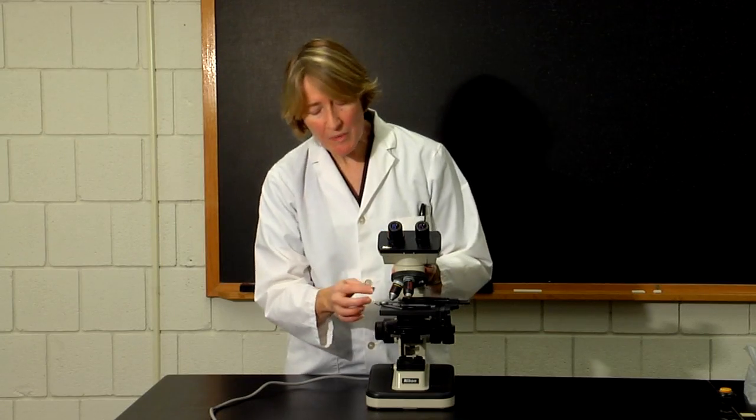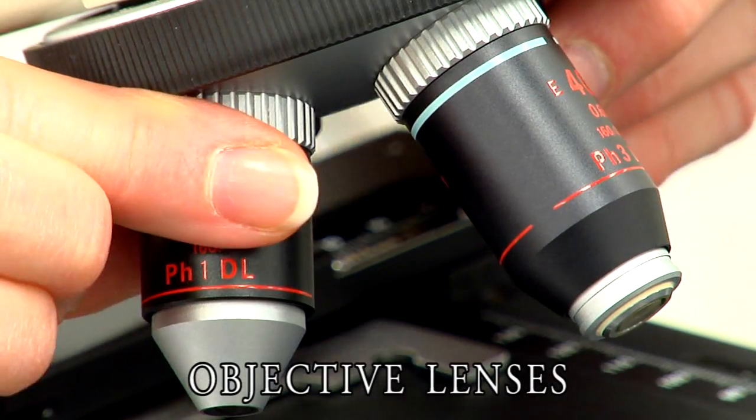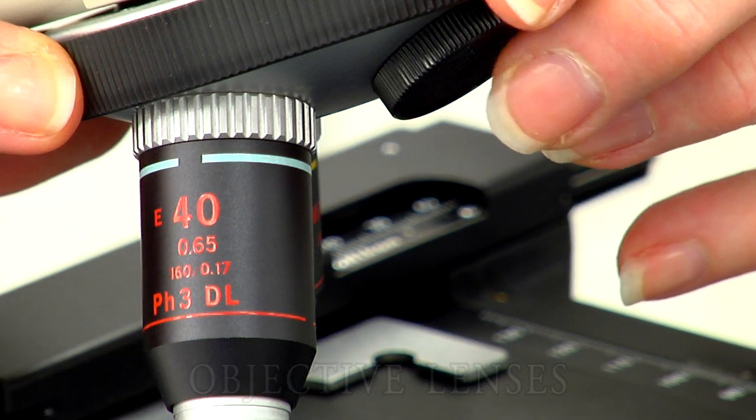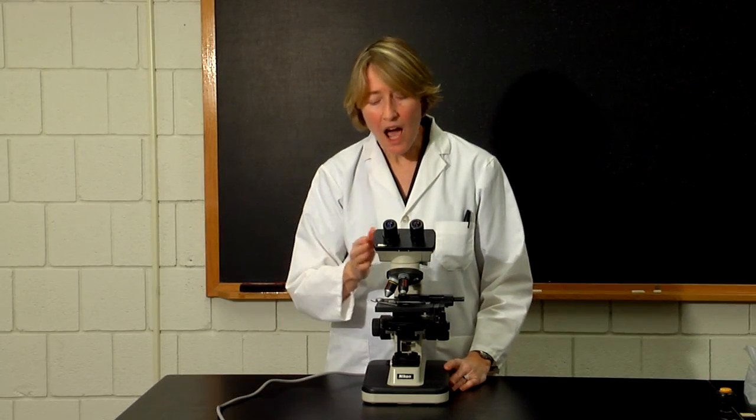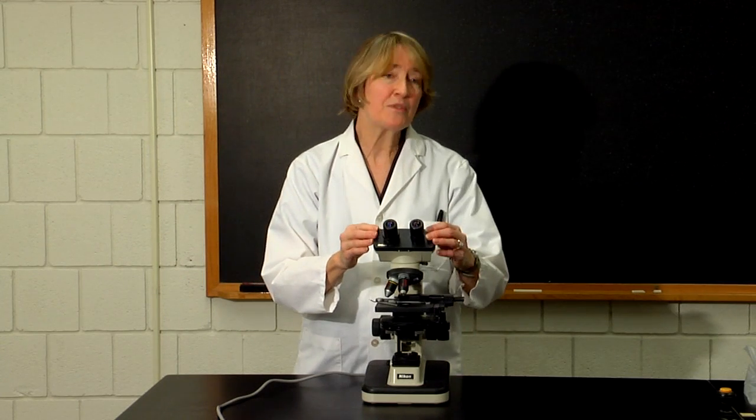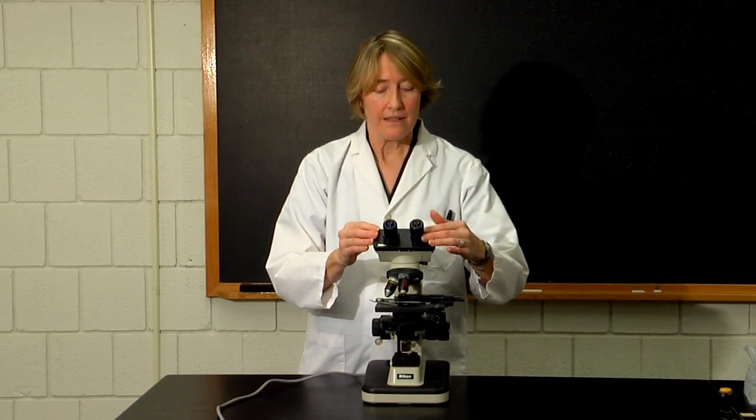In the nose piece, you have the objective lenses, which have a 10x objective and a 40x. The final magnification of the object is the product of the ocular magnification times the objective magnification. So these lenses can magnify your samples 100x, which would be 10x times the 10x objective, up to 400x, 10x times the 40x objective.